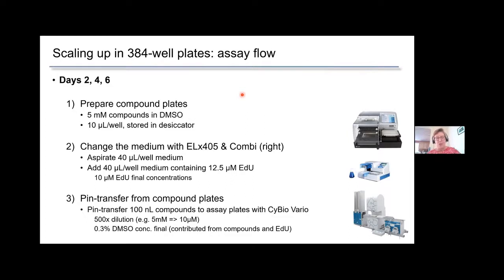However, what you can do is you can buy even yeast replicators, which are 96 or 384 pins, even plastic. And you can even use those manually in your lab to transfer compounds. Alternatively, if you're testing just a couple of compounds, you would just pipette them in.